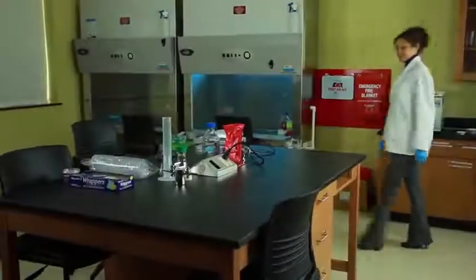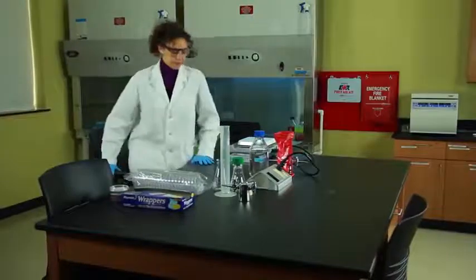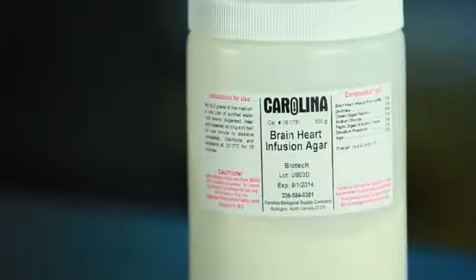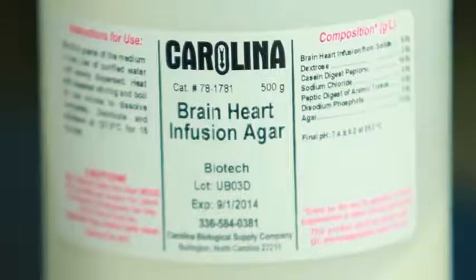In order to grow, cells need very specific environmental conditions: food, energy, proper temperature, and humidity. When growing cells in the lab, we have to create these conditions using culture media. Solid culture media is a mixture of agar and nutrients poured into Petri dishes. In this exercise, we'll demonstrate the steps for preparing Brain Heart Infusion Agar.